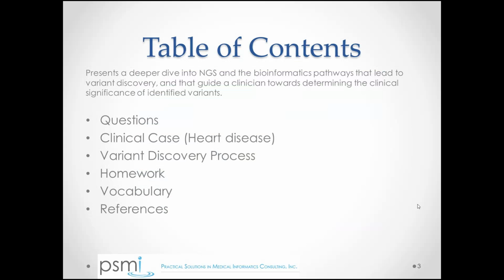For today, we're going to delve right into the clinical case. We're going to present a case of a 38-year-old guy who had a heart attack, and he's curious to know: is his heart disease hereditary, and if so, what mutation would have caused it? We're going to walk through the whole process end to end of figuring out exactly what mutation in this patient caused his heart disease.